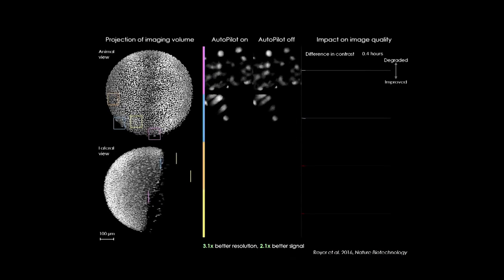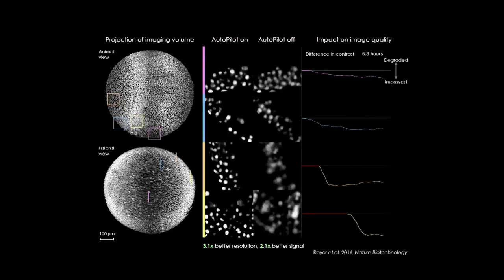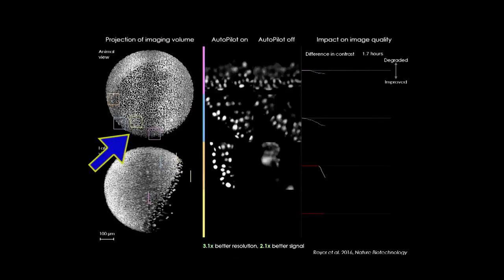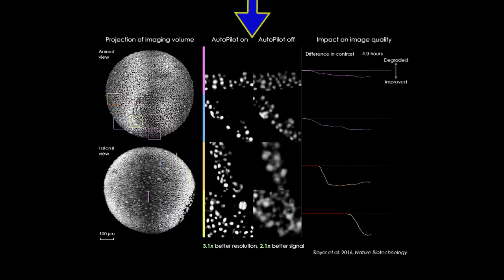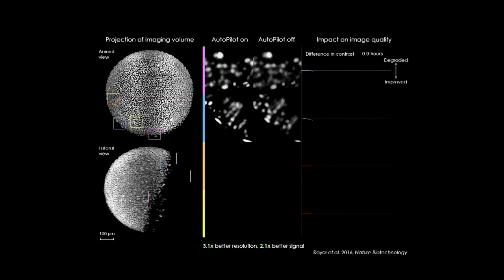And so with this combined adaptive imaging approach, we can now hand the experiment over to this real-time control layer and have it optimize the image quality. For example, in a zebrafish embryo it has the following effect. If you look at different regions here, we're trying to track the cells as they form the nervous system. We can't really, without the adaptive imaging, follow cells in many parts of the sample anymore. Over time, image quality just degrades. And with the adaptive imaging approach, we can recover that high resolution.